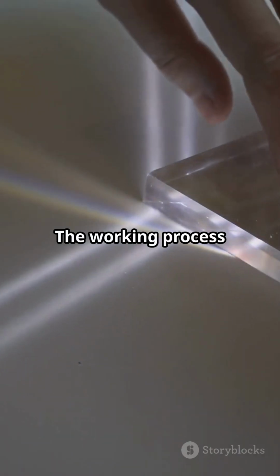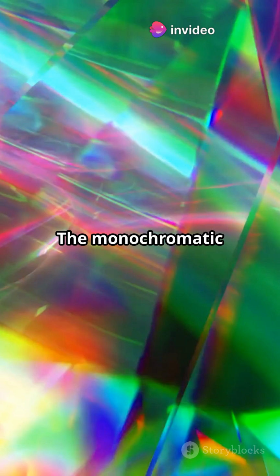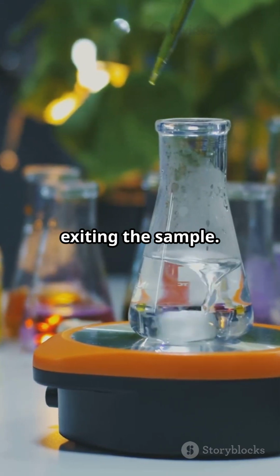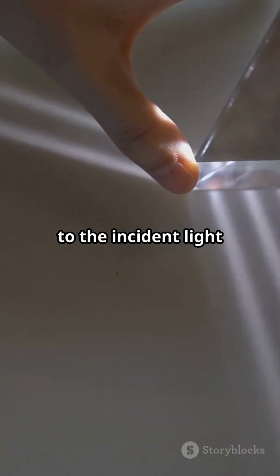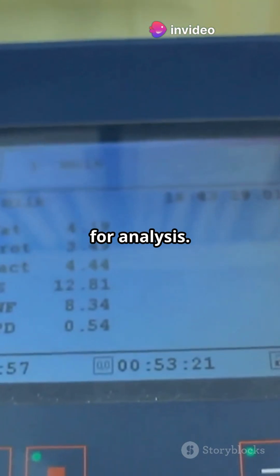The working process is as follows. Light from the source passes through the monochromator, which selects a specific wavelength. The monochromatic light travels through the sample in the cuvette. The detector measures the intensity of light exiting the sample. The system compares the transmitted light to the incident light to calculate absorbance or transmittance. Results are displayed or recorded for analysis.